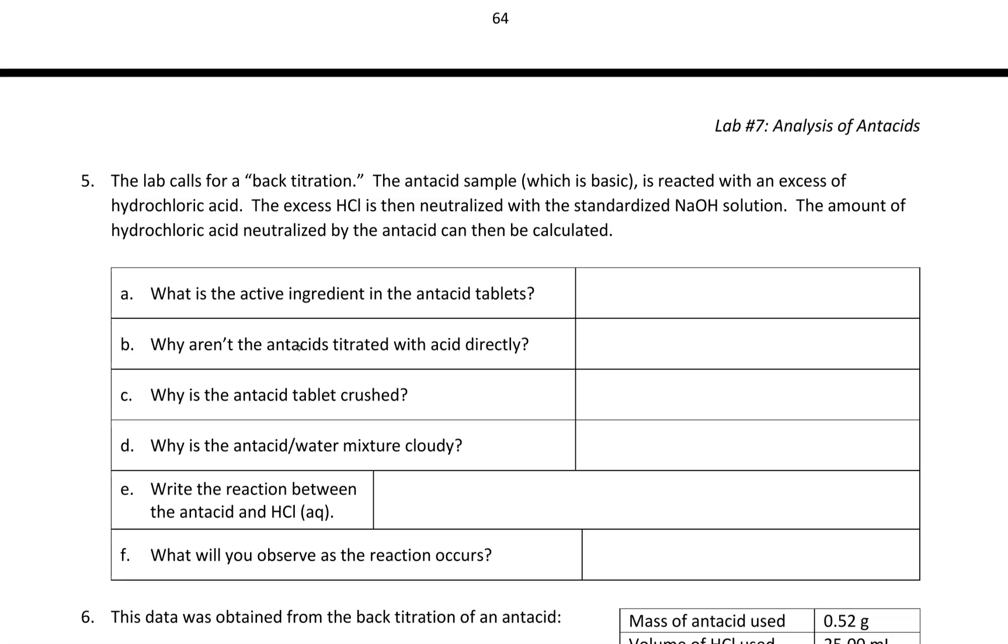So basically, if you were thinking about this, you might have said, well, I know that an antacid has to be basic. Why am I titrating it with more base? Wouldn't I need to titrate it with an acid to get it to neutralize? And kudos to you for picking up on that. Yeah, this at first glance might not make sense.